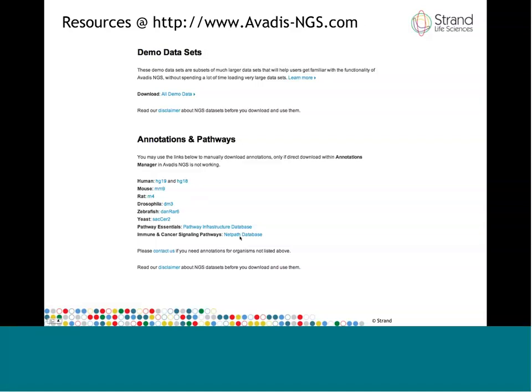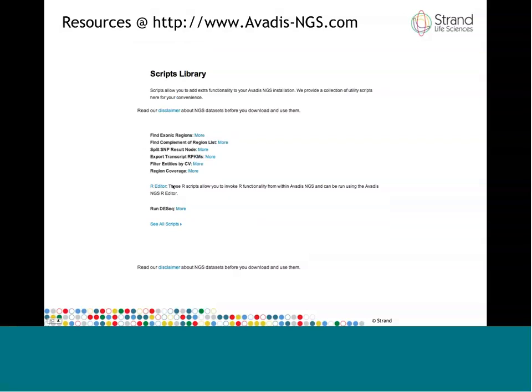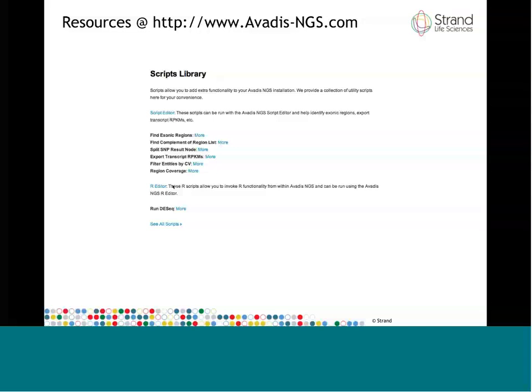In addition, you've got pathway databases present here, and you've got what we call a scripts library, which is our way of delivering additional functionality to your Avadis NGS installation. So we send you a little text file with a few lines of programming. You open that in the Avadis NGS script editor. There's a particular menu that allows you to open that script, and once you open and run it, you'll get the functionality that you need, even though it was not present inside the product itself.